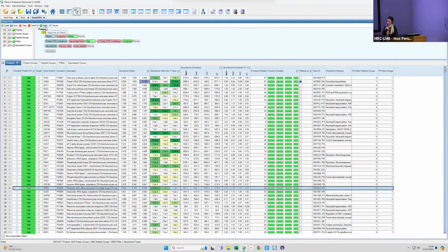So if I was to apply any of these filters and then provide you with the data, with these filters applied, you might be missing out on information. So this is why I usually send the basic ones, but I want you to understand enough how you can apply these filters because you can play with the data, right? It is really important that you take ownership of the data yourself because the more questions you know how to ask to the software, the better you can grasp how good or how bad your data is.